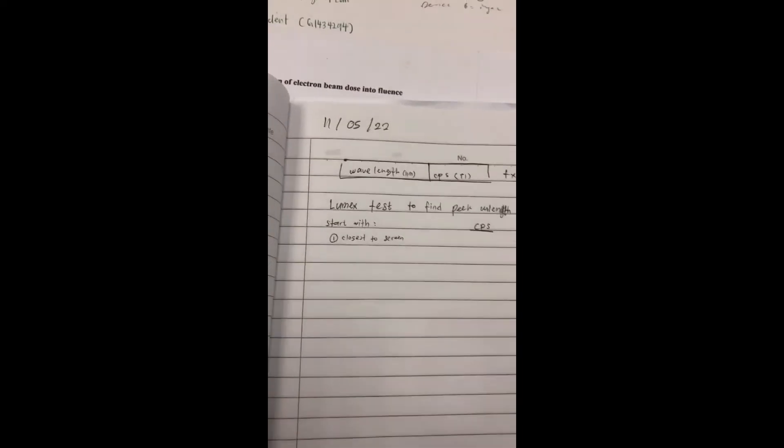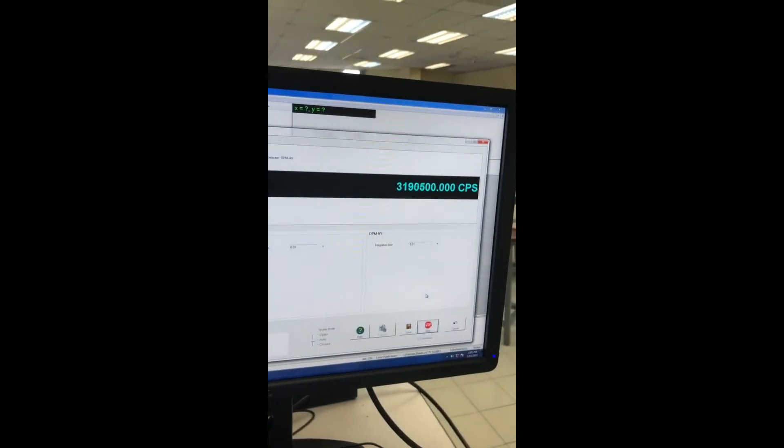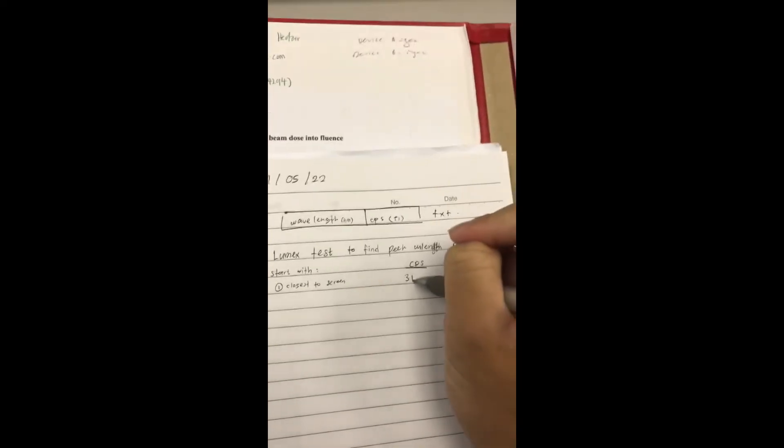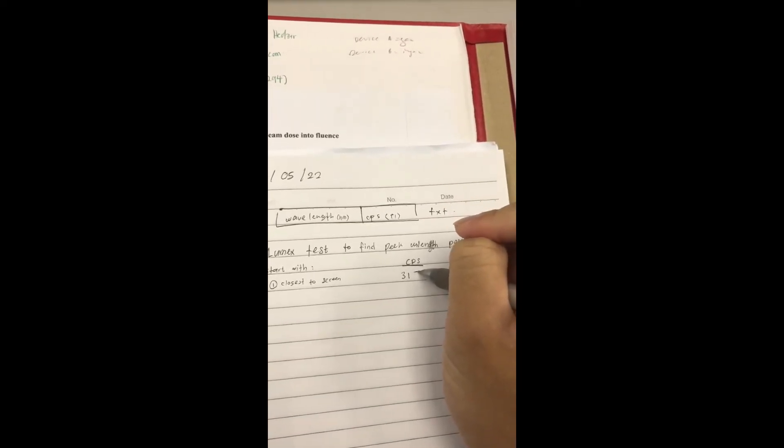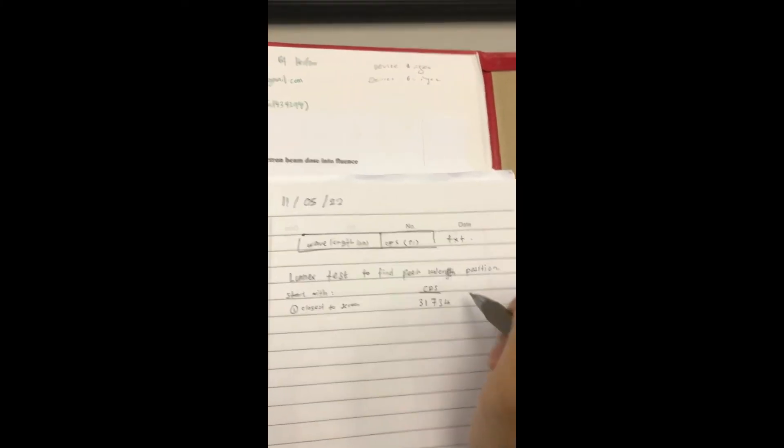Then after that, you need to jot down what the value is. For example, right there is around 317,340.00.